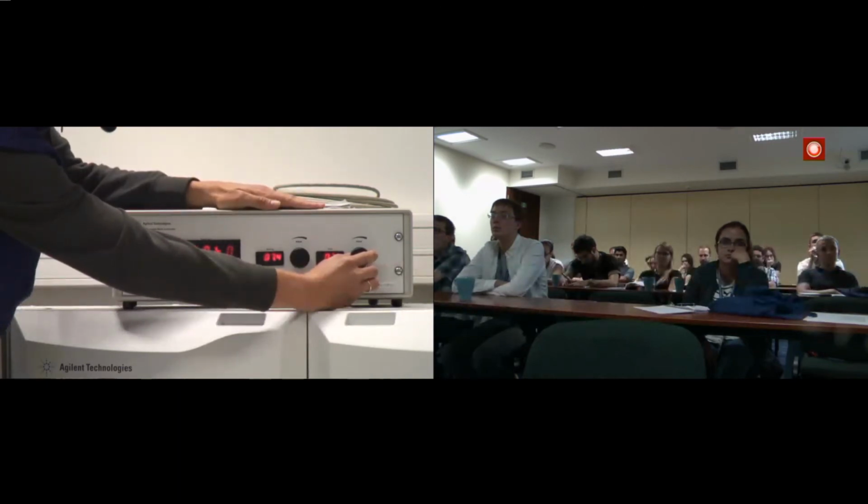So it is very important to pack our material very carefully inside of the container made of zirconia, because you have to make sure that the center of mass of your sample is placed on the main axis of that rotor.